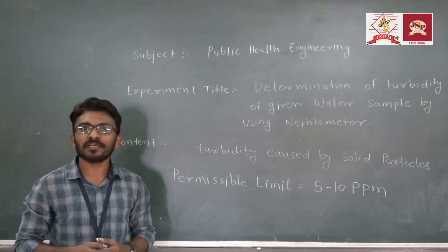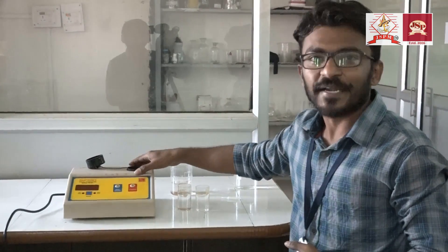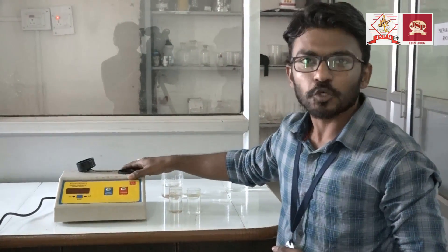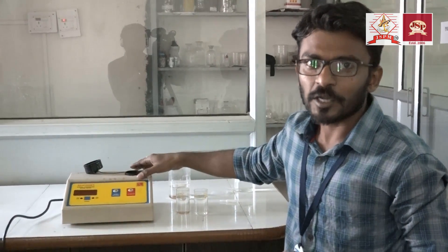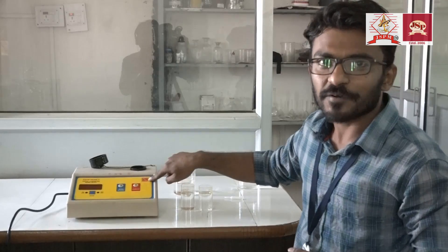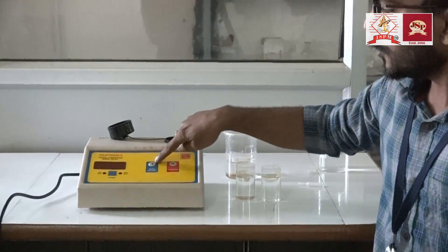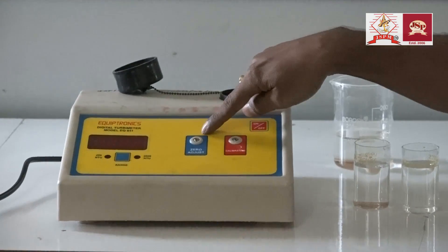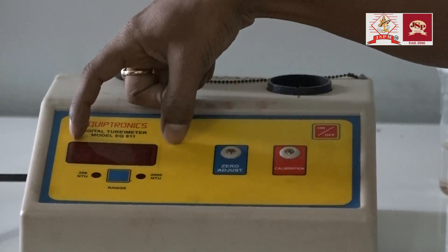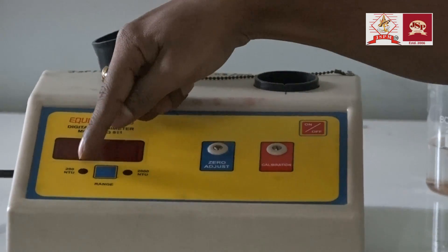We are going to conduct the experiment. This is the instrument used for finding out the turbidity of the water sample. This instrument is called a nephelometer or digital turbidity meter. One button is given for on and off. There are two knobs for zero adjustment and calibration. Here is the display and here is the button for the range of turbidity.